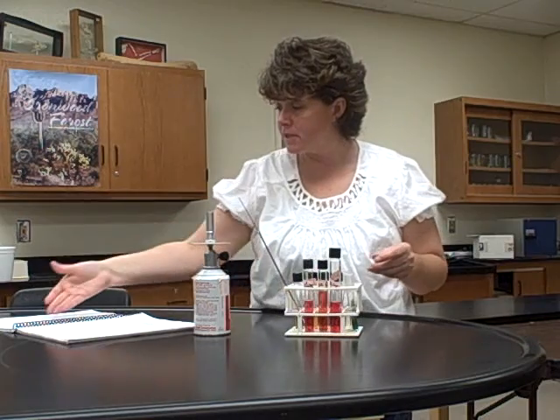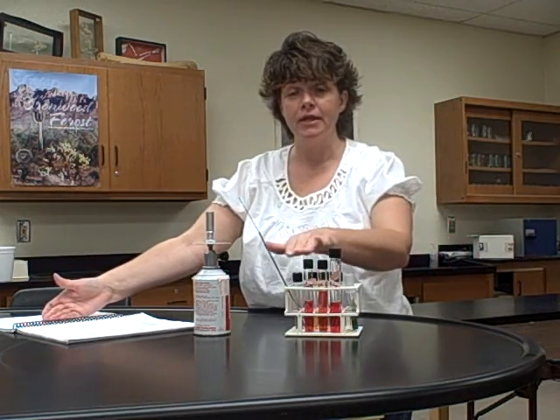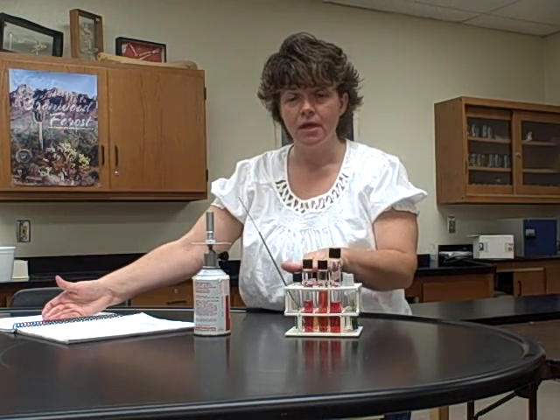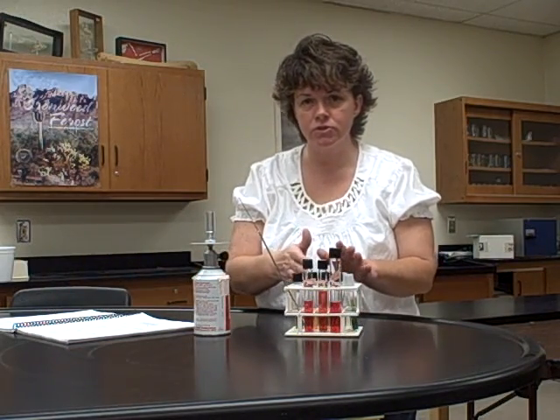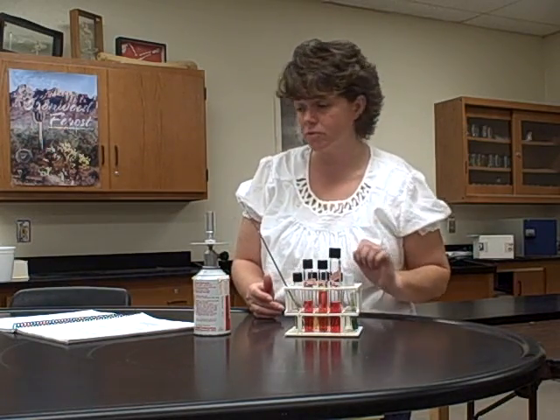Do note that E. coli and Enterobacter were also possibly assigned to you in the fermentation tube, so you may or may not use the same ones, depending on what culture you were assigned in the first part. You may end up with 2 or 3 cultures, depending on which ones you're assigned.